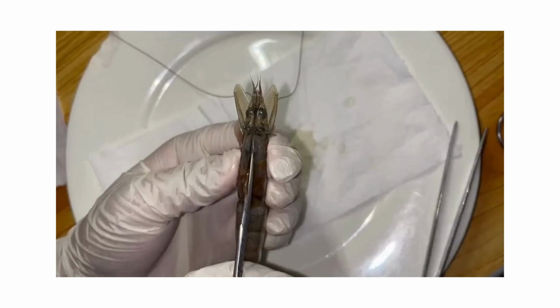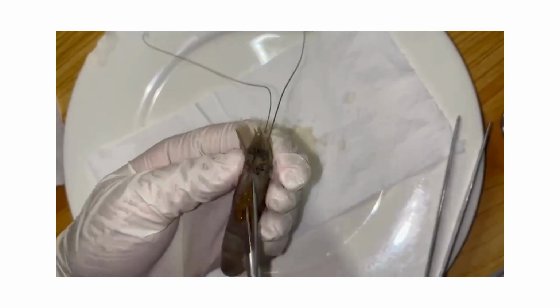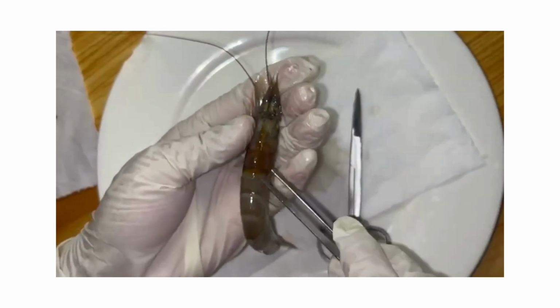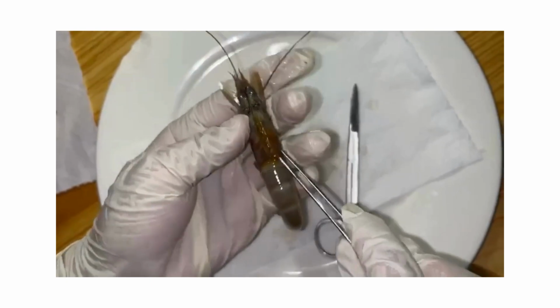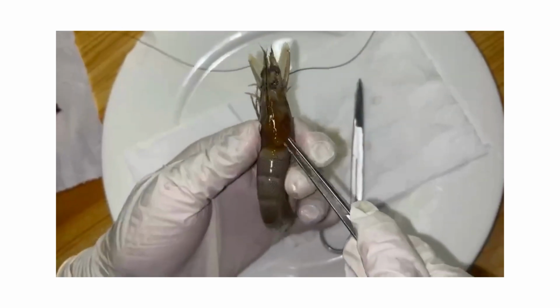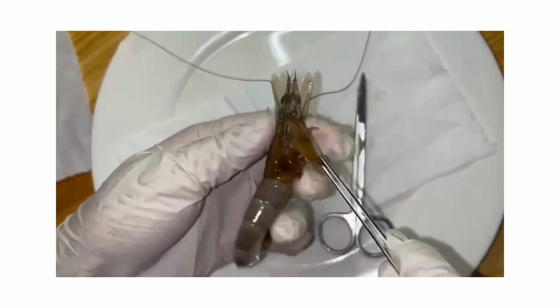Next is the removal of the carapace. The shell is gently lifted and removed using forceps to avoid damaging the soft tissues underneath. Once the carapace is removed, internal organs such as the gills, heart, stomach, and hepatopancreas become visible. This step is essential for studying the shrimp's respiratory, circulatory, and digestive systems in detail.